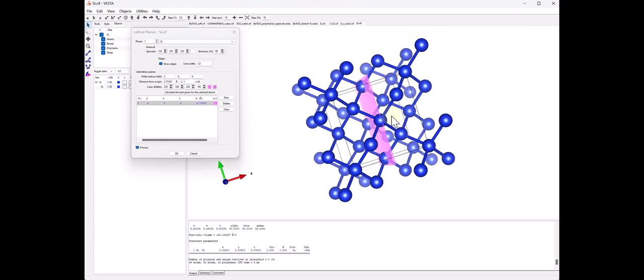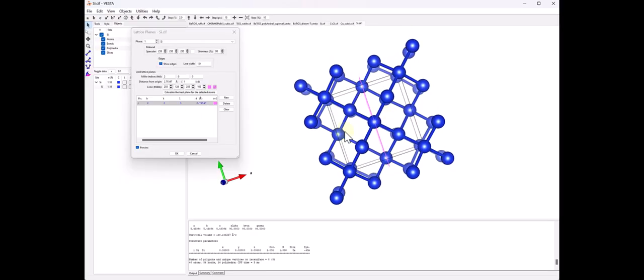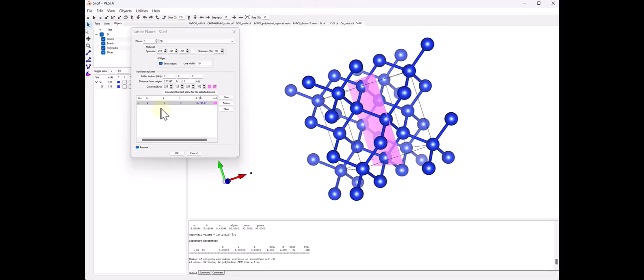So one more handy thing that can make it nice to visualize interplanar spacings or d-spacings is, right now I have the pink plane, that's the 200 plane that we labeled before. And right now it's at 1 times that 200 distance, 1 times the interplanar spacing. So if I want to label, say, 2 times that distance, which would be the next plane in that same distance series, I could add another plane. Let's change the color just to make it clear. And now for this second plane, let's multiply that by 2 and then enter.